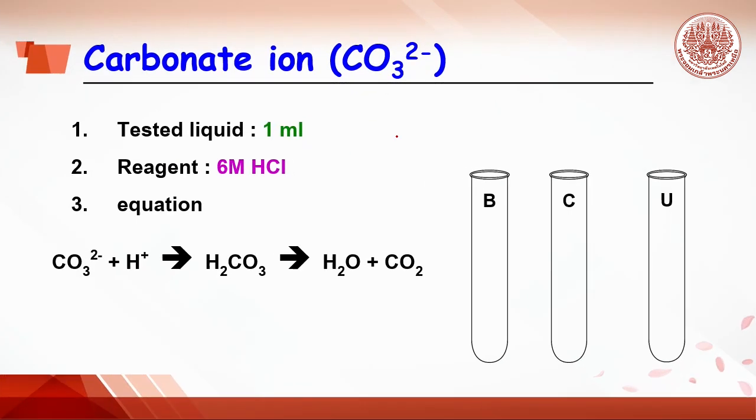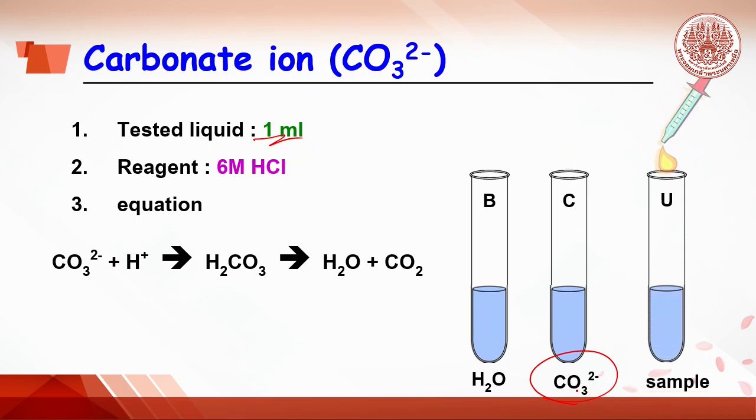For example, carbonate ion testing. 1 mL of testing liquid like water is dropped into the B tube. And 1 mL of sodium carbonate, which is carbonate ion, is dropped into the C tube. And 1 mL of unknown sample is added in the U tube.